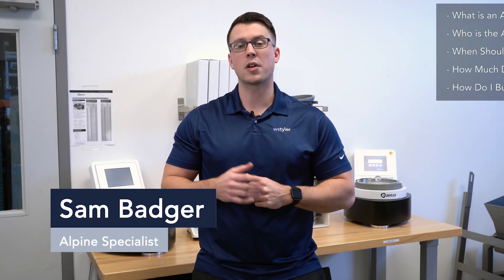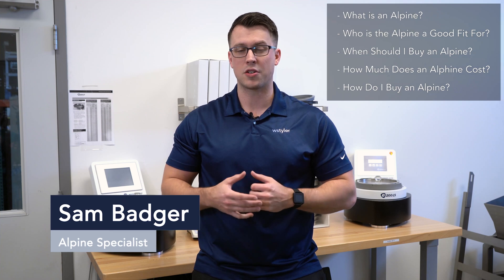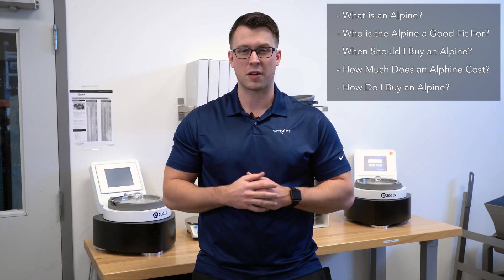Hi, I'm Sam from W.S. Tyler, your Alpine guide. Today we're going to be going over the ins and outs of the Alpine and determining whether or not the device is right for your particle analysis needs.